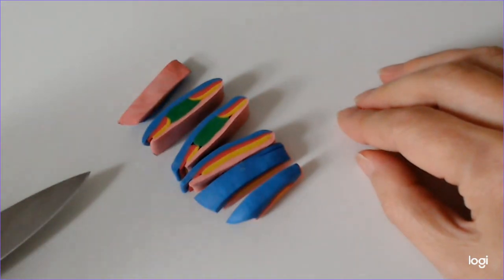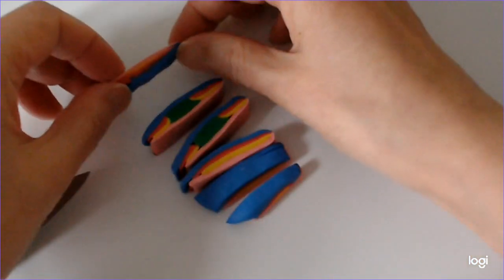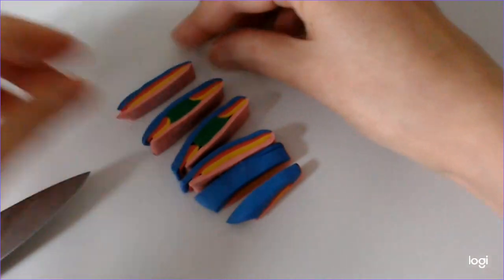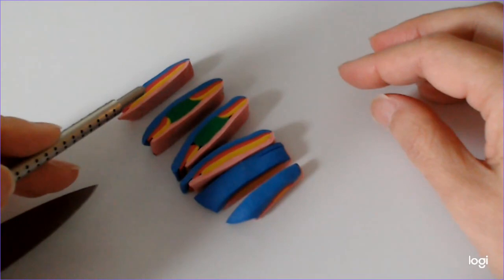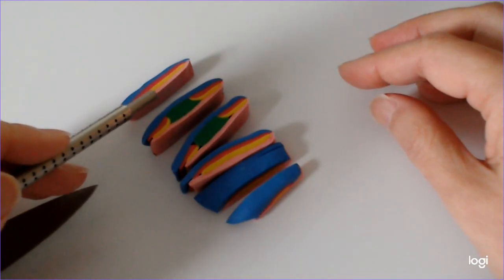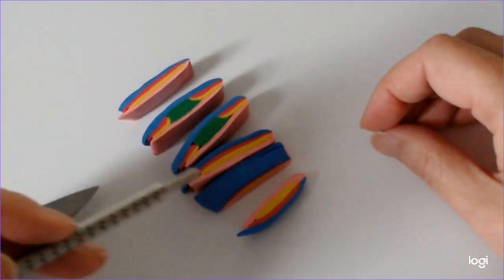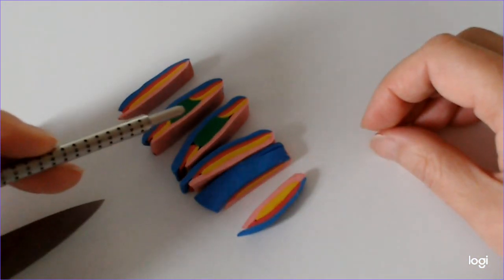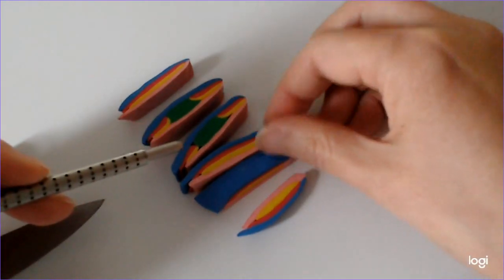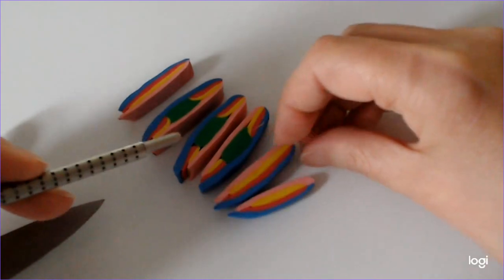So this specimen is in 6 slices. We have our sagittal appearance with the skin, subcutaneous tissue, tarsus and conjunctiva. We can see that in slices 1 and 6 there is no lesion, but we have a lesion in slices 2, 3, 4, but not 5.